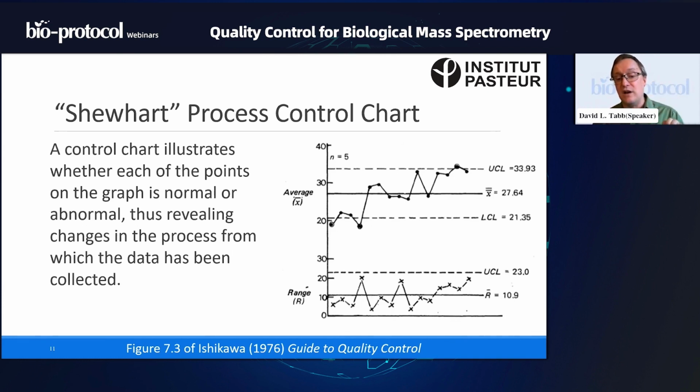I have five raw files. Each of them has a different number of distinct peptides observed. I'm going to take the middle one, or I'm going to take the average. I guess in the Shewhart case here, they use the average rather than the median. I'm going to post that average as that day's value on the top.